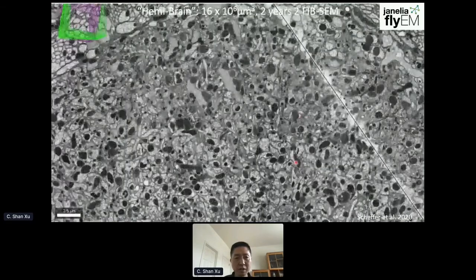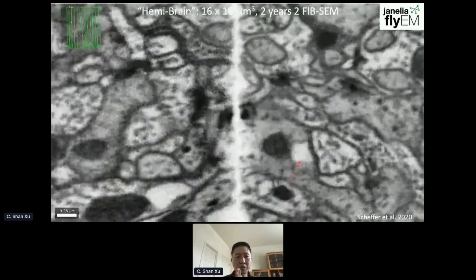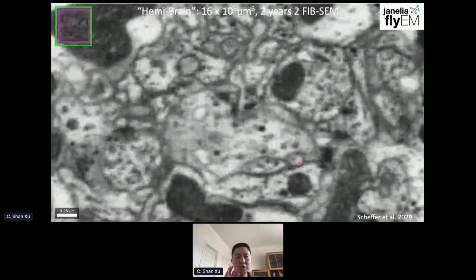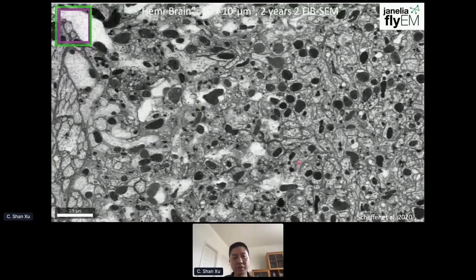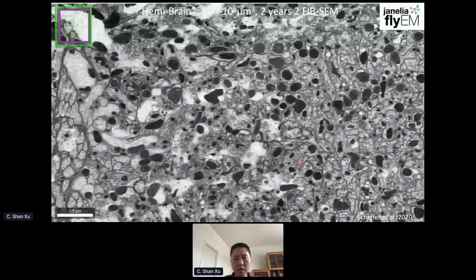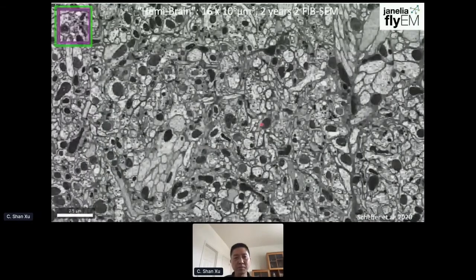Now what you're seeing here is the seam where we digitally restitched these 2 slabs that were imaged on 2 machines individually. The goal here is to trace the neuron across both these seams and across this entire volume, every single neuron. That's what we call dense reconstruction, not just sparsely picking out a few neurons. As a matter of fact, you can see a lot of features here, right? Mitochondria, for example, besides the neuronal tracing. In fact, there are more than 6 million mitos here.